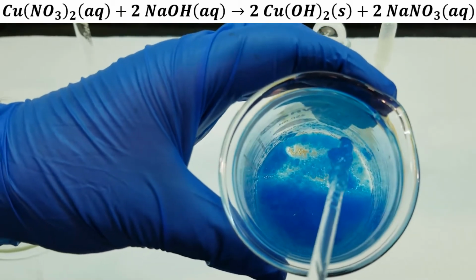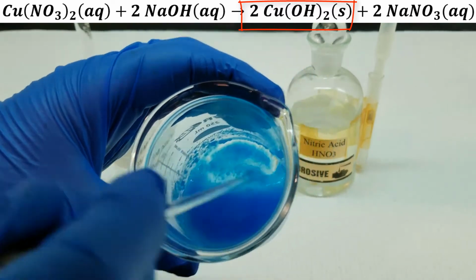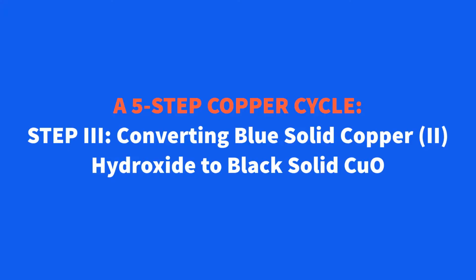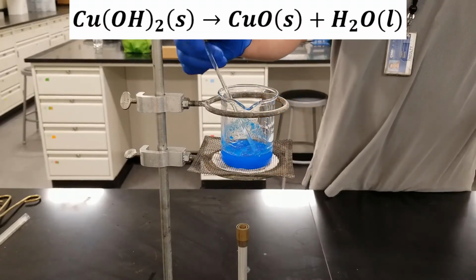You see that kind of sludge? That's our copper hydroxide. Okay, here's our blue sludge of copper hydroxide.